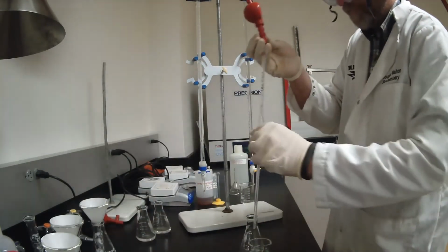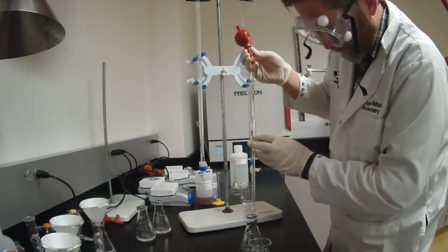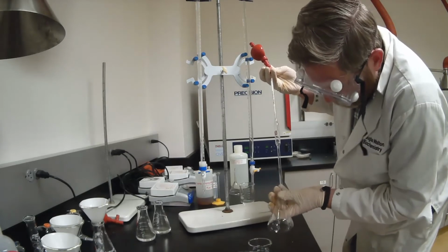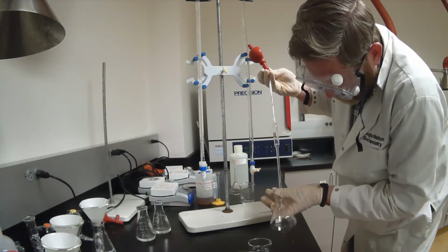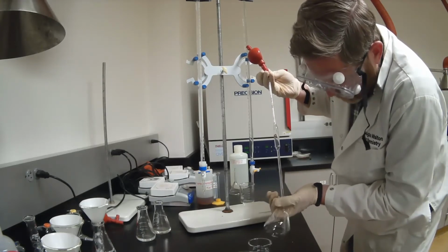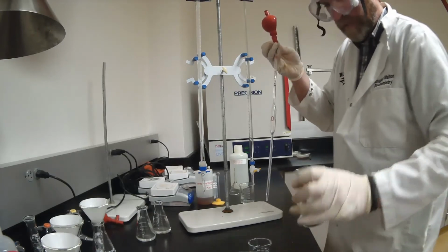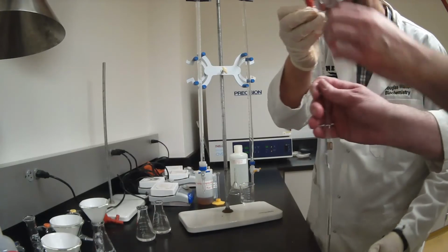Again, we rinse. So my lovely assistant's going to pipette that one.